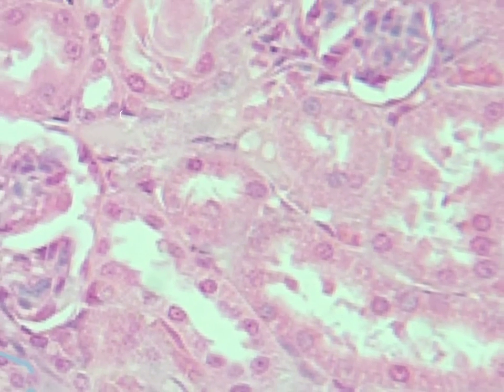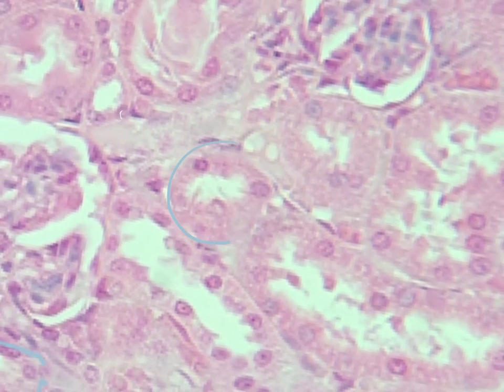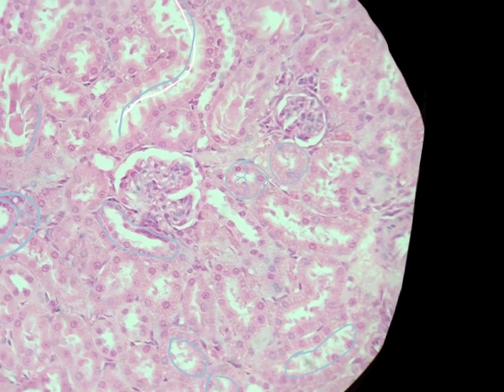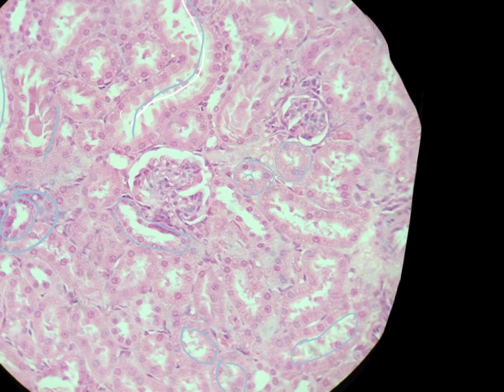Let's take these two right here, this one here, this one here. As you notice, there's one nucleus there, maybe 1, 2 more there, so 3 total, and here you're seeing about 3 total. So the point is that in a proximal convoluted tubule, the cells are actually so big that usually in one tubule you're not going to see nearly as many nuclei. They're not going to be nice and organized like you see in other tissue.